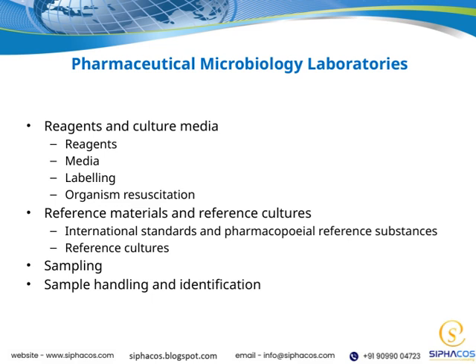Once samples are collected, handling and identification are critical to prevent contamination and to accurately determine the presence or absence of microorganisms. All these elements are interconnected and play a vital role in ensuring the safety, efficacy, and quality of pharmaceutical products. They form the backbone of microbiological testing in our laboratories, aligning with our overall commitment to high standards.